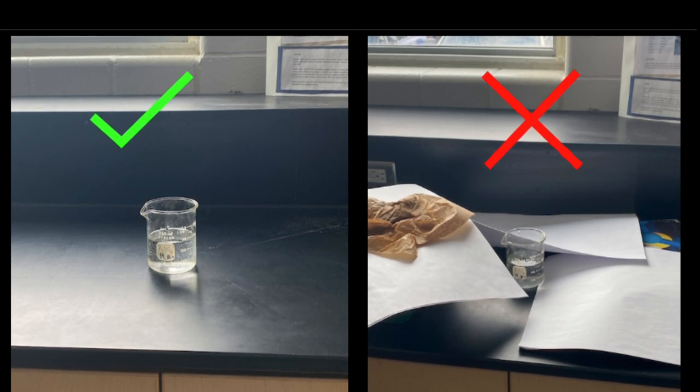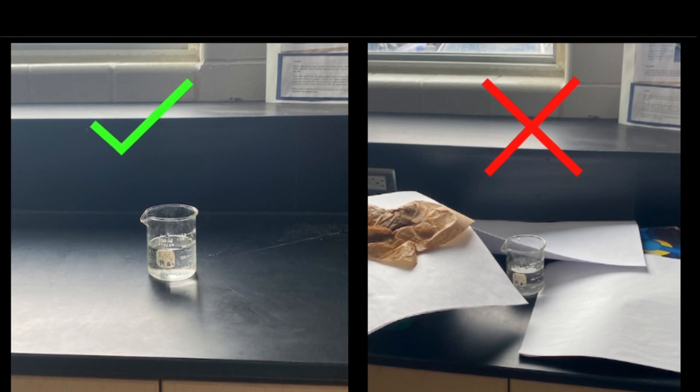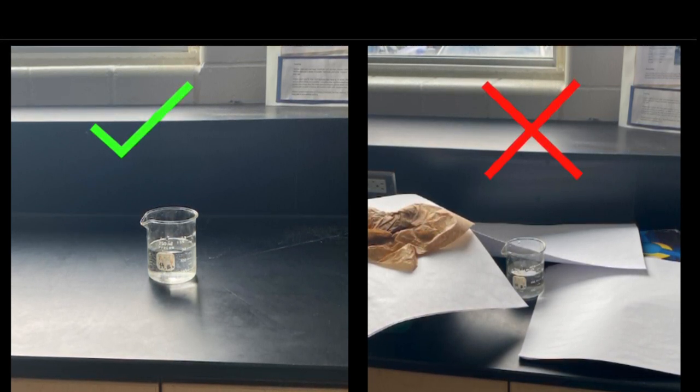A beaker should be used in an open space and it should not be obstructed. In cases where elements contain toxic fumes, you will be notified and will use a fume hood.